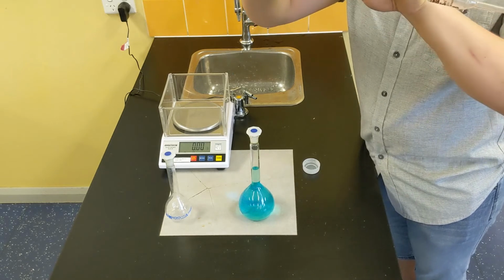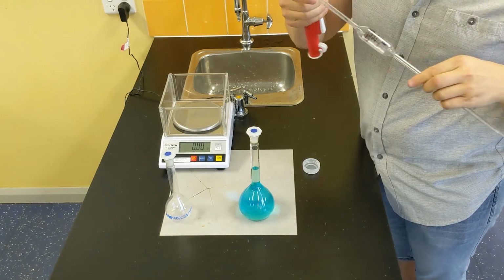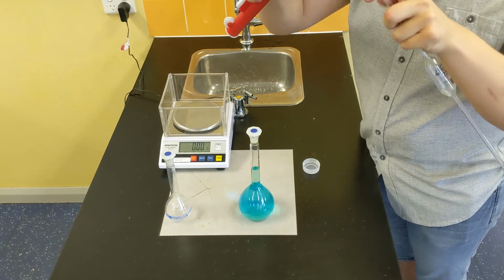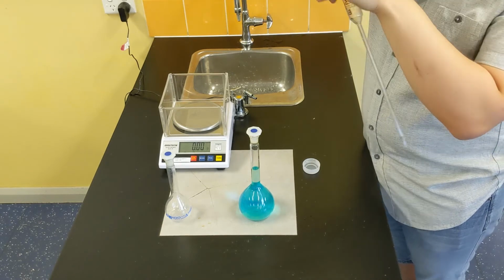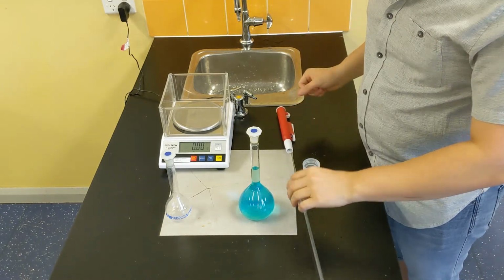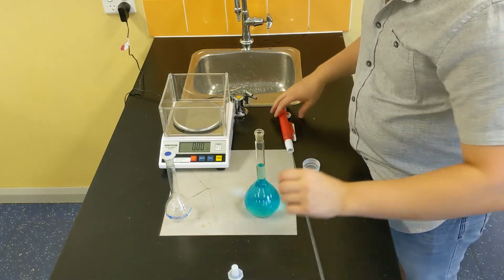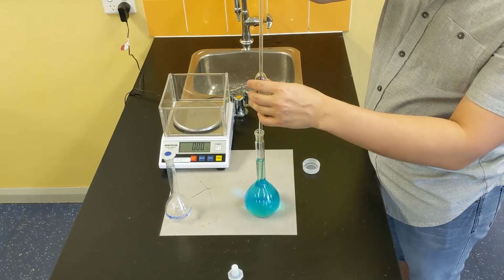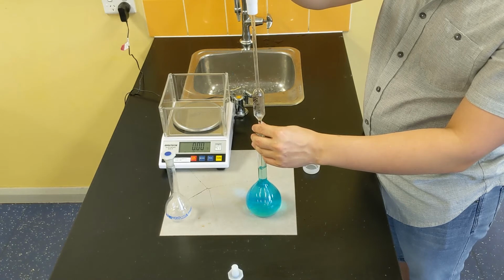I'm attaching a filler. I was trying to show you, but I kind of missed the camera. What I'm trying to show you is that when you are putting the filler and the pipette together, you hold the top end of the pipette really close to where you're about to insert it, rather than holding it at the end. What can happen is that the stem can actually end up snapping and you can stab yourself in the wrist, which isn't ideal, but I'll show you that in person in class next time.